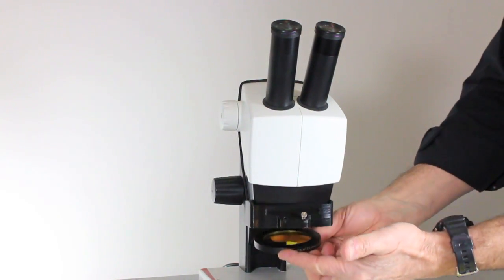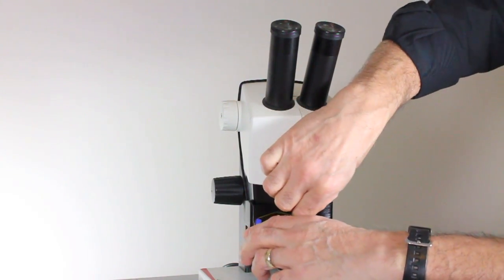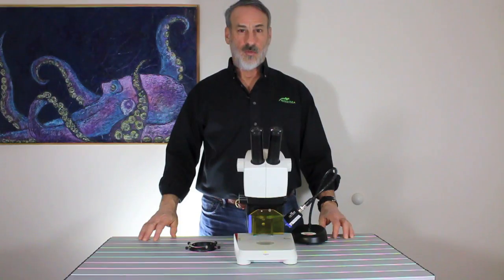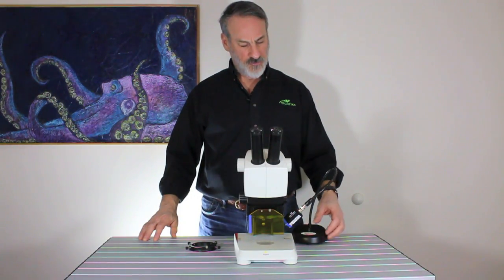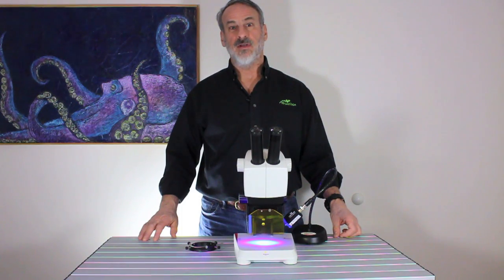The barrier filter attaches magnetically, then pivot in the shield, and you're done. With these components in place, you can use our standard excitation sources to add a powerful fluorescence capability to your EZ4.